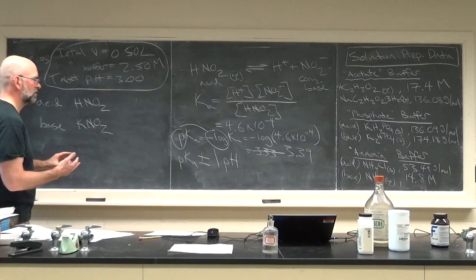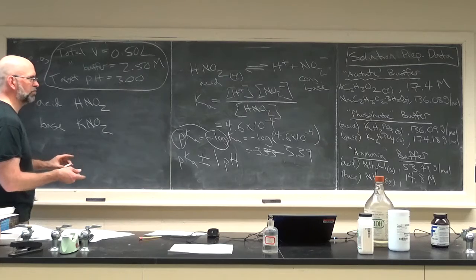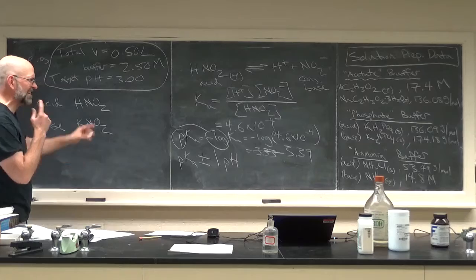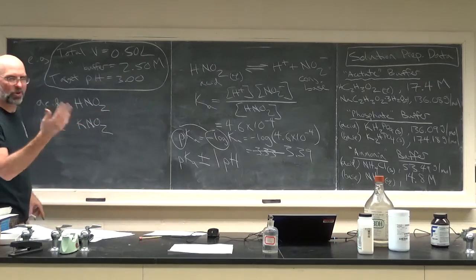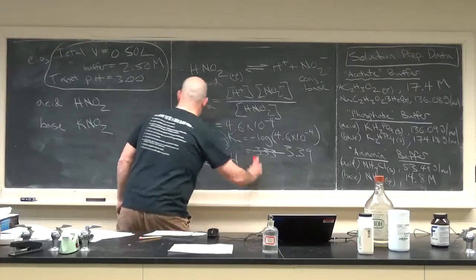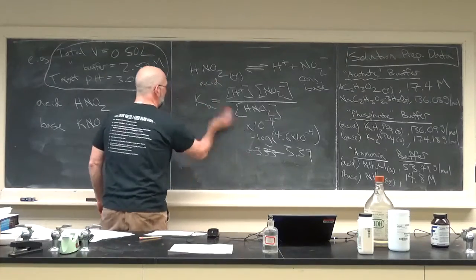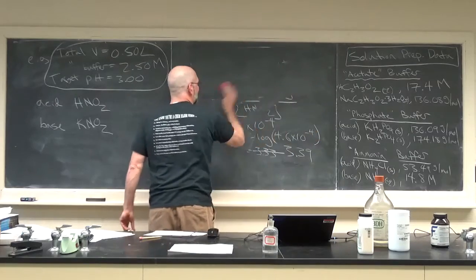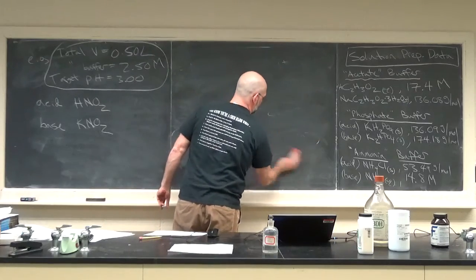Excellent. And I'm going to kind of pull rank here. Let's figure out the pKa's. I think I said this in one of the other questions, so I'm not going in the right order. But since we've done this already, let's go ahead and get the pKa's of all the things you're going to use in lab. Sorry, this is a long video.